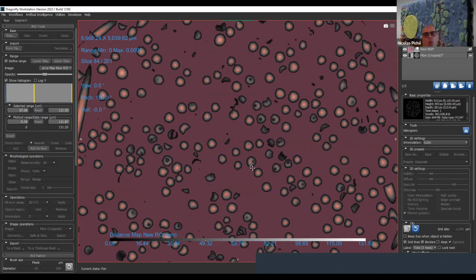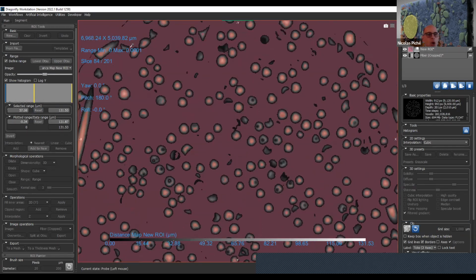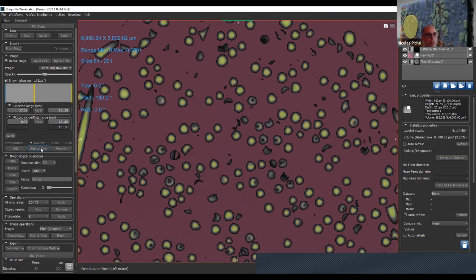So now what I will do is make a ROI with the selection. Now I will have color in each of those, but they are still not individual colors. Okay, so now I have green everywhere, and hopefully only one piece of green in each of the fibers. I should have done it more carefully to be sure, but let's say that I've done it right.